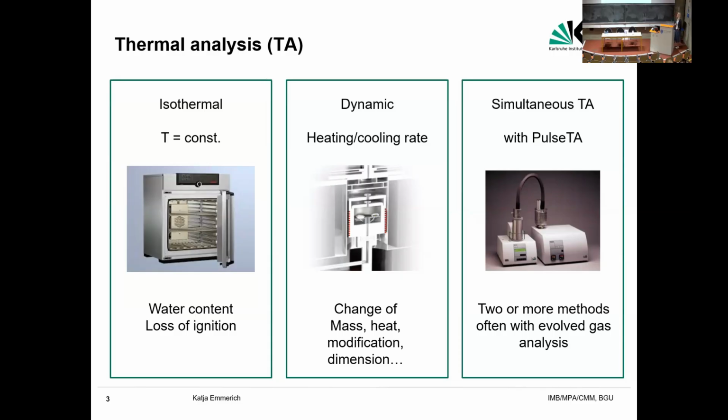In contrast, we have dynamic thermal analysis, where you apply a defined temperature time program. You can heat your sample with a defined heating rate, then you can keep your sample at a certain temperature, heat it again, cool it down. This depends on the question you want to solve by thermal analysis. You're free to apply any temperature time program as long as your equipment allows the program.